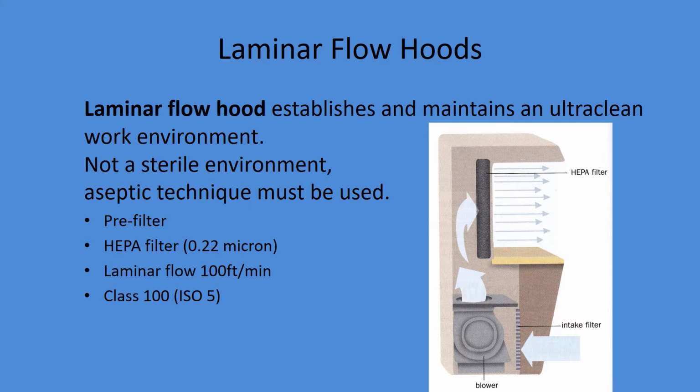All right, so getting into the equipment needed to maintain sterility, we're going to compound within a laminar flow hood. So because of pharmacy compounding and usually the length of storage, at least 24 hours, we'll need to compound within a laminar flow hood.